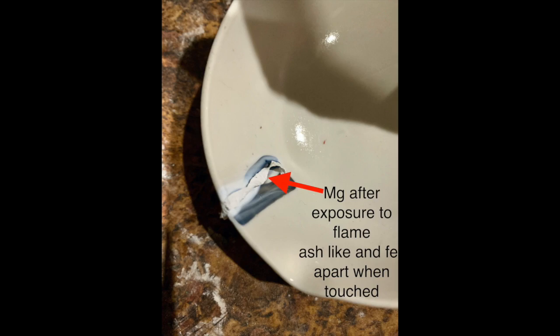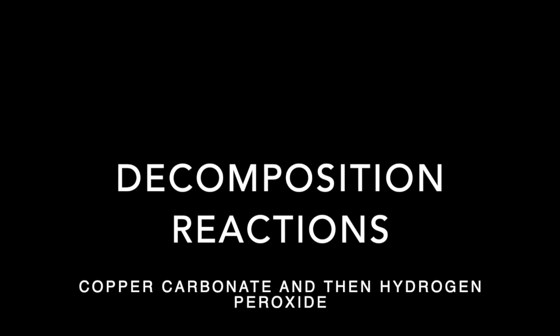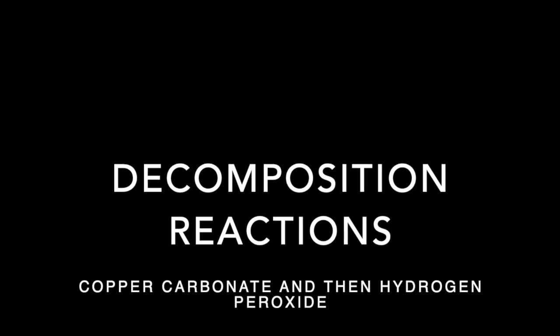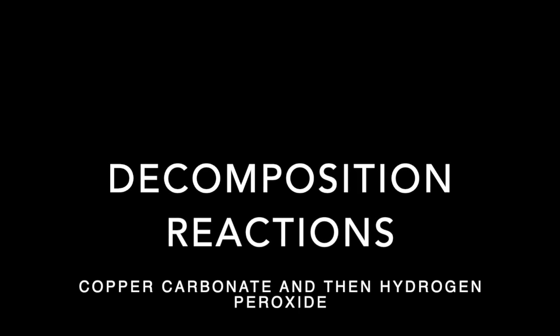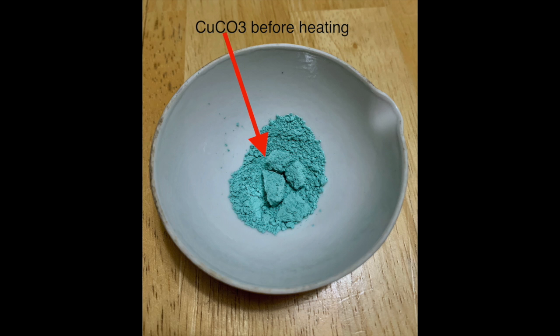So that little white strip there is magnesium after flame exposure. The next experiment set is the decomposition reactions. So first, copper carbonate. We're going to see what copper carbonate looks like before you heat it. You can see it's that kind of blue-green color.